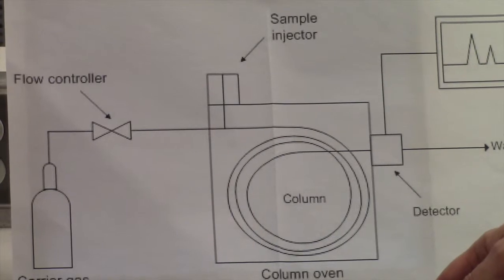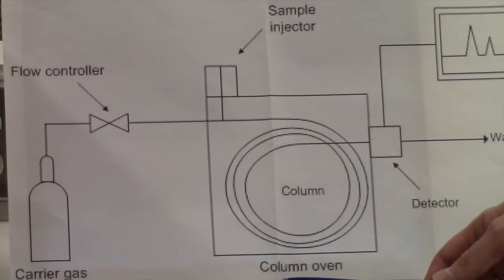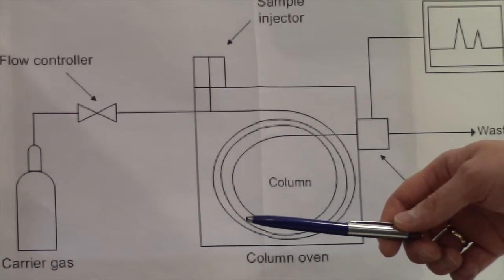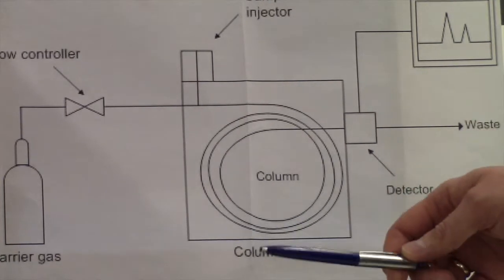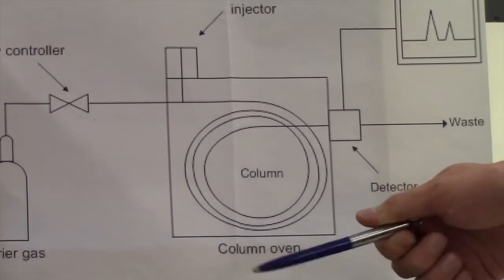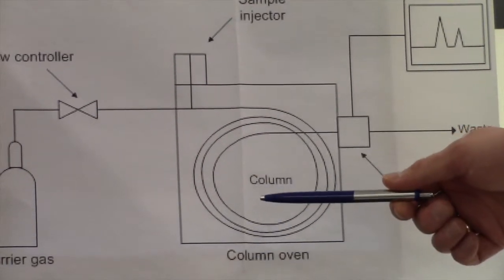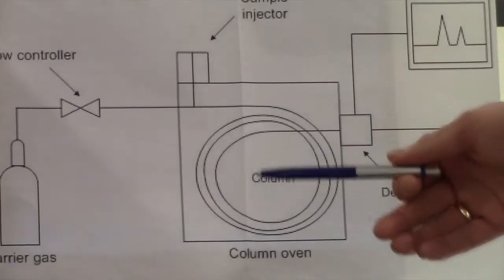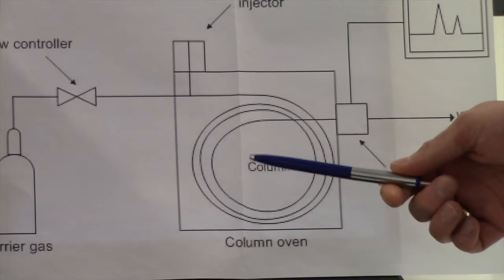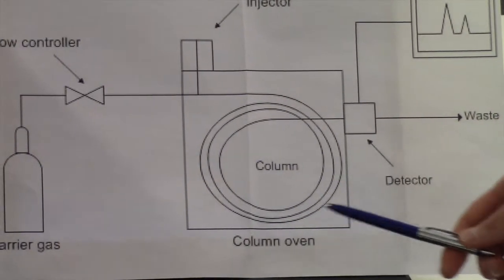And the difference with packed columns is that, again, as the name suggests, packed columns are packed with some polymer or some adsorptive material, which helps to separate constituents of the injected sample.